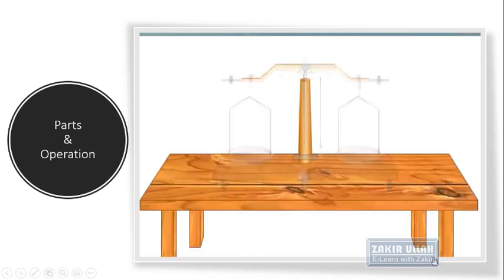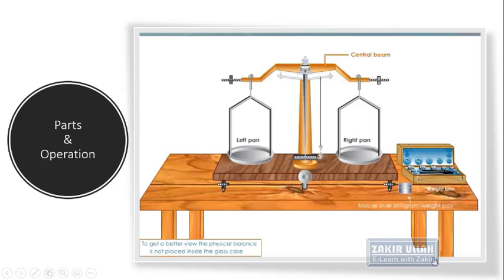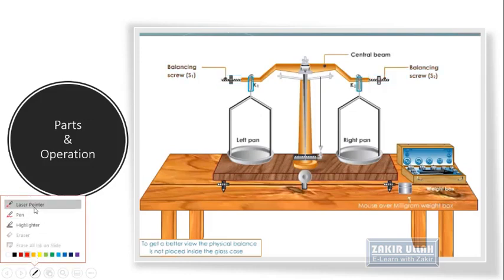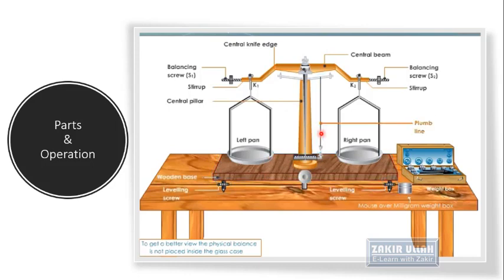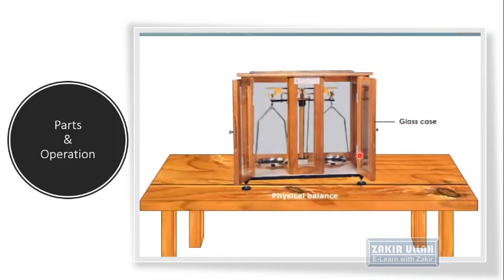A physical balance is shown here, taken out of its box for a better viewing experience. It comes with a weight box containing different weights. There is a central beam connected with balancing screws to adjust the level to zero, knobs K1 and K2 connected with the stirrup, a central knife edge connected with the central pillar, a wooden base with a plumb line showing the level, a beam support, a pointer showing any error, a graduated scale below, two pans, and a glass case.